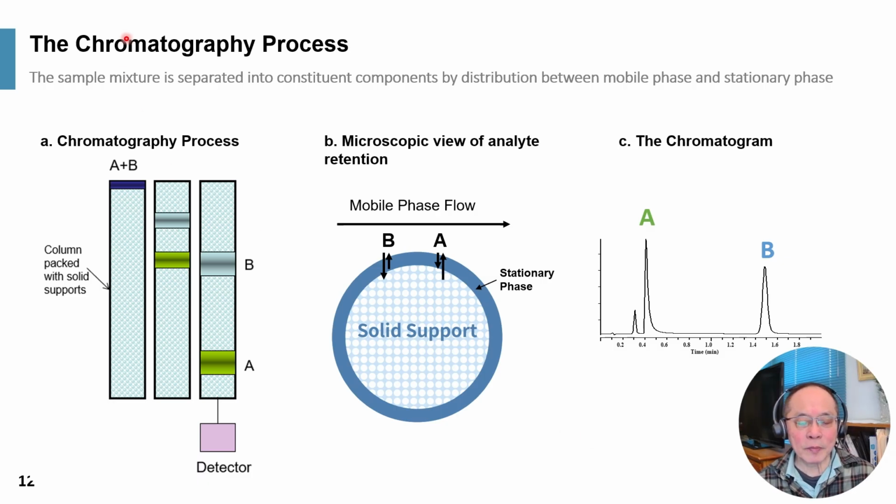Here's the chromatographic process that has been described in earlier episodes, where we describe the entire chromatography process, showing you a mixture of A plus B with the faster eluting band A coming first, going through a detector first, right? In the chromatogram, A is eluting first because it's less retained in the column. And then there's also less column band broadening for A, while B is definitely going to give you a broader peak. So the in-column band broadening is specific and tied to the chromatographic process.